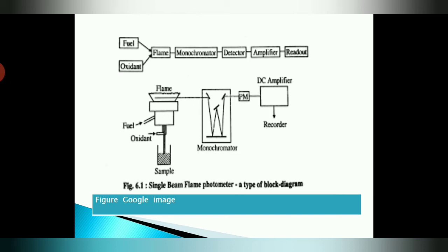In most instruments, these two are easily adjustable but within certain limits. So, introduction of the sample into the flame: the uniform feeding of the sample and standard into the region of excitation is very important for the accuracy of the procedure. For flame analysis, the substance is generally dissolved in acid and then sprayed with the atomizer, as an aerosol of liquid droplets in the air and oxygen mixture with the gas. So uniform feeding of the sample is most important while we are using flame emission spectroscopy. Next is what?